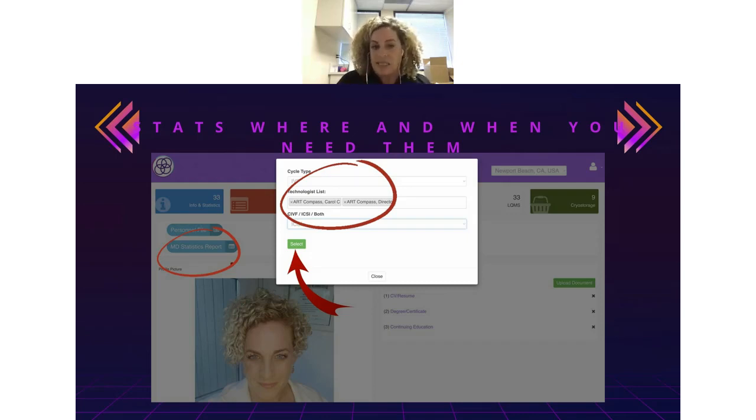Now, one of the other nice features is the lab director. So I'm showing you here, the lab director has chosen a very experienced embryologist and a very new embryologist. And so when you start typing the names of your staff and then you hit select, you can actually just compare two people together in the platform. And if you just hit select, you'll bring up everybody in your whole lab to compare stats.